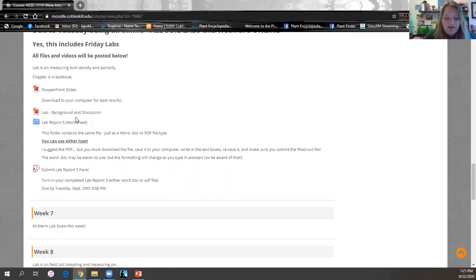It was mostly weighing soils, packing it into a crucible so that we could measure bulk density. And then also, talking about soil tilth, which is like typically a soil you would find outside that maybe had some sort of mechanical process put on it, like tilling, that had been watered.